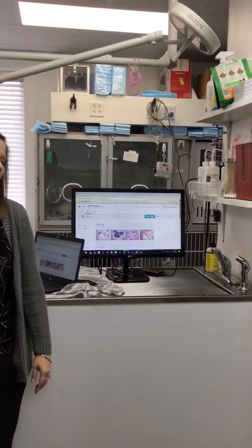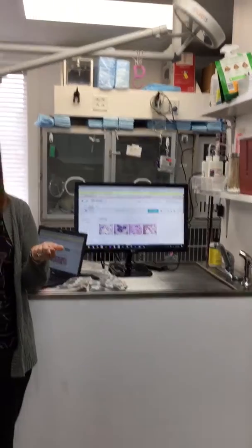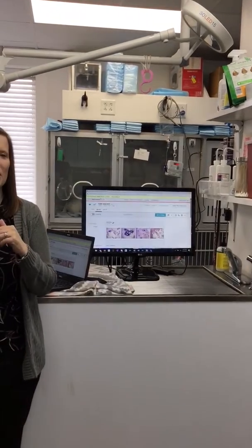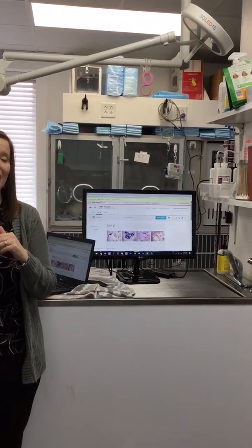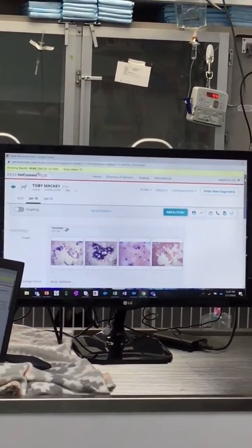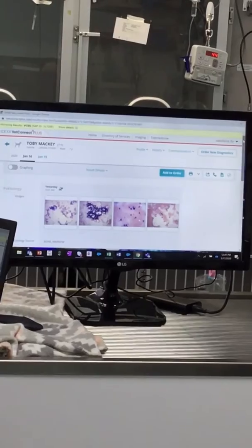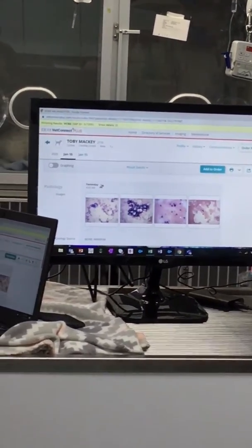A lot of people don't know this, but EVET only sends a request every 5 minutes. I don't know if y'all knew that. There's nothing we can do to change that. We've asked. It's the only practice management software that does that. But yeah, it only sends it over every 5 minutes. Y'all have gotten used to it, so it's probably normal for y'all. It's funny when I come in, I'm like, what's wrong? What's wrong? Oh wait, it's not 5 minutes yet. There it is. Cool. All right.